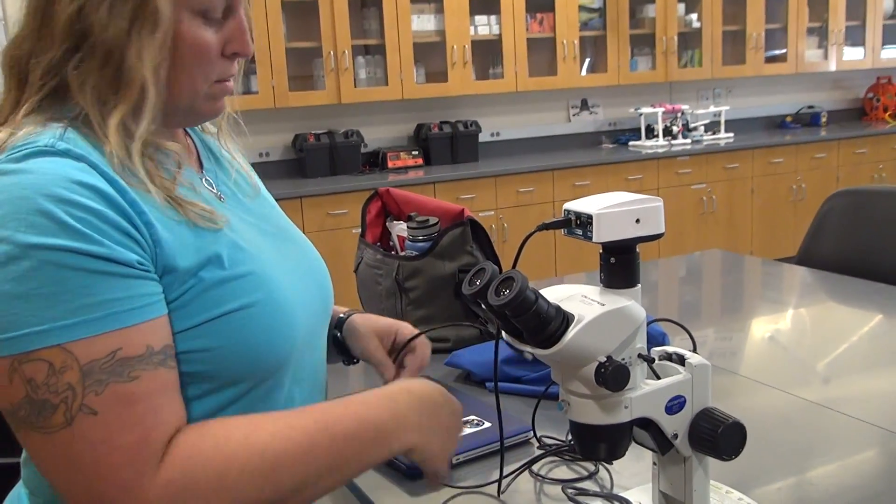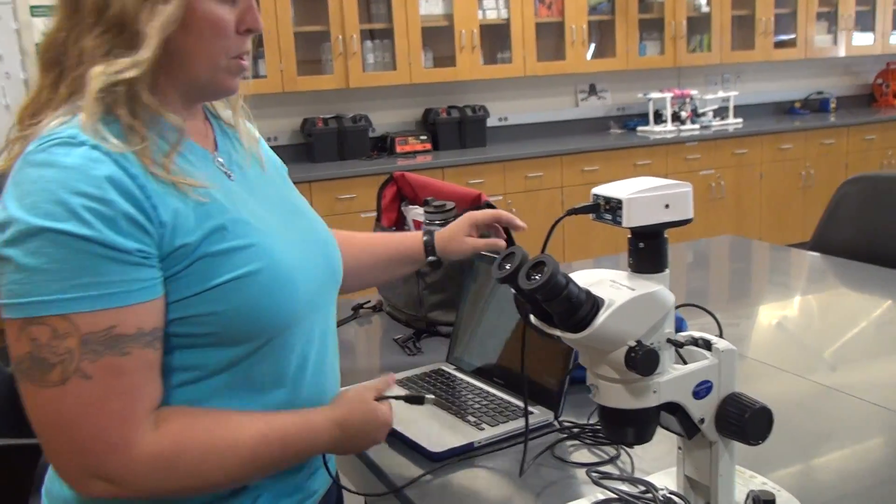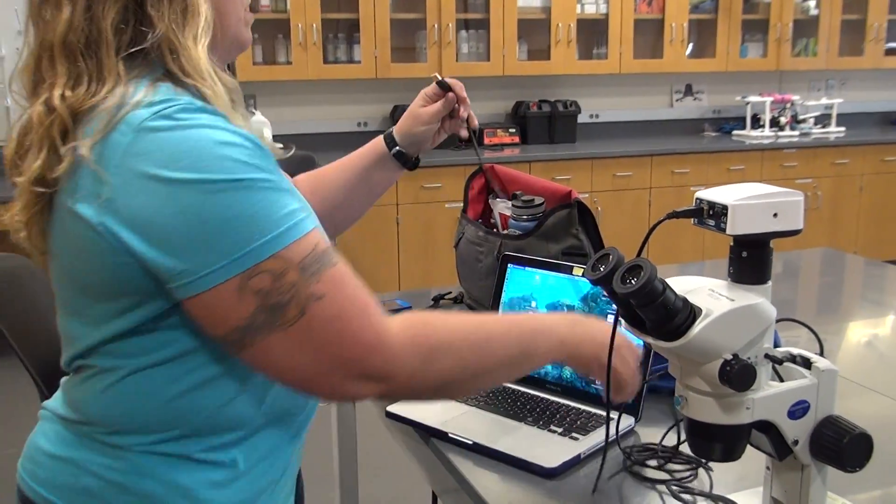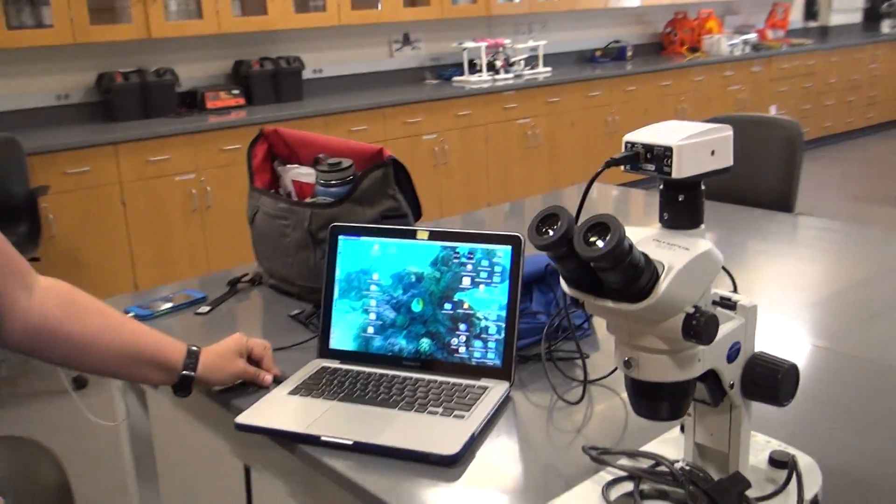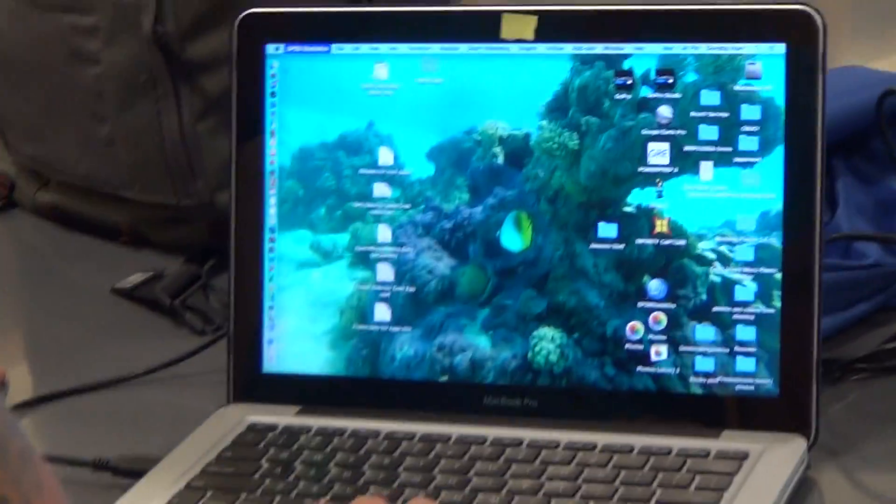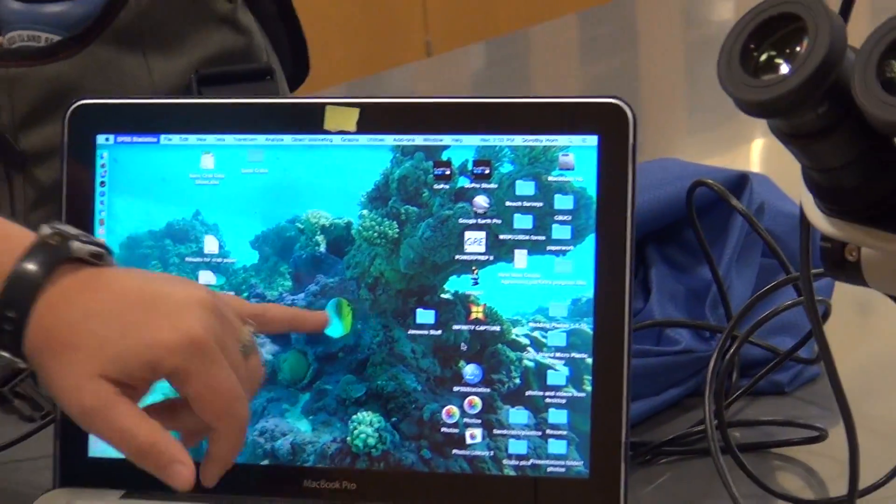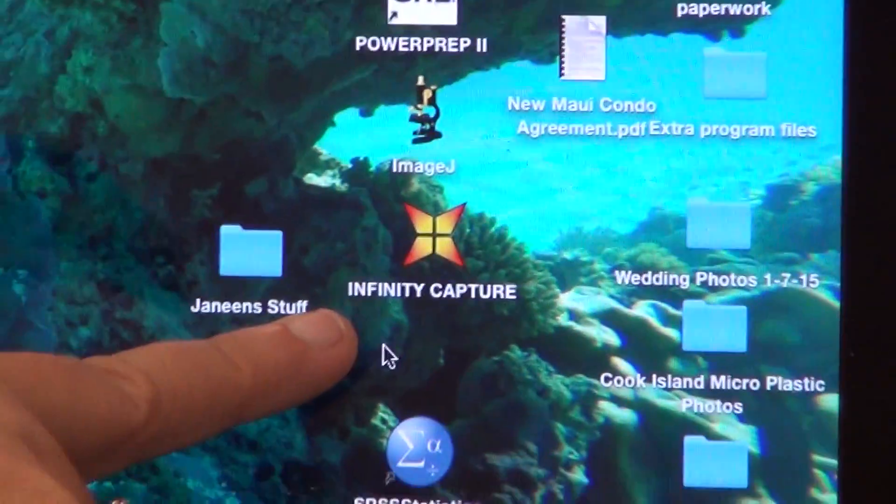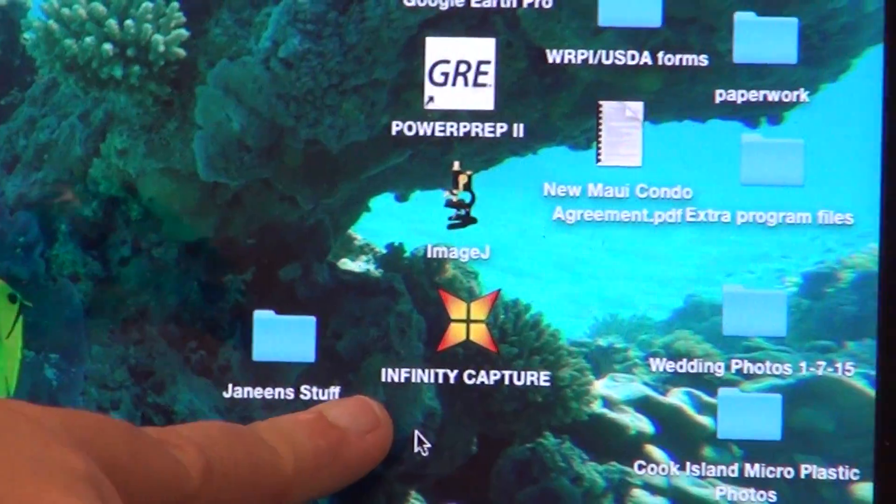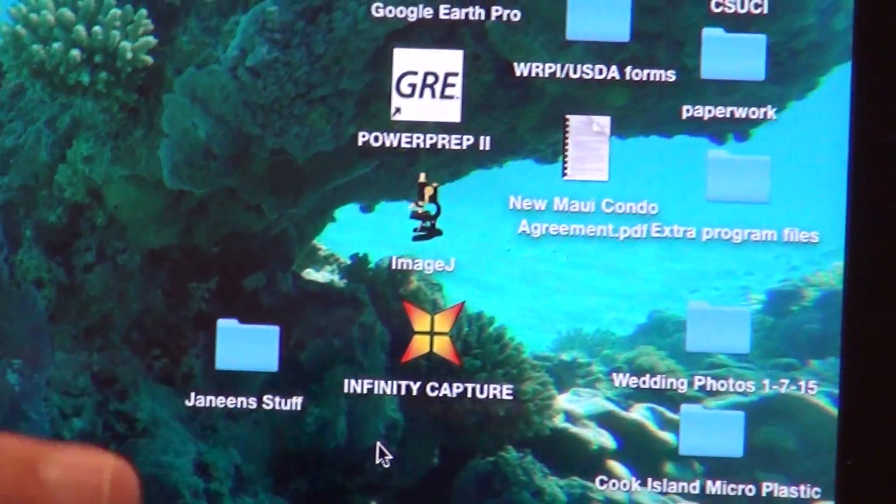It's set so that it's the same way. You're going to need a laptop or computer. You're going to put your USB cord into the USB port on your computer. I have pre-downloaded this program called Infinity Capture. It's a free program that you can download off of the website. It's safe. It has a PC and a Mac version, so you're good to go.